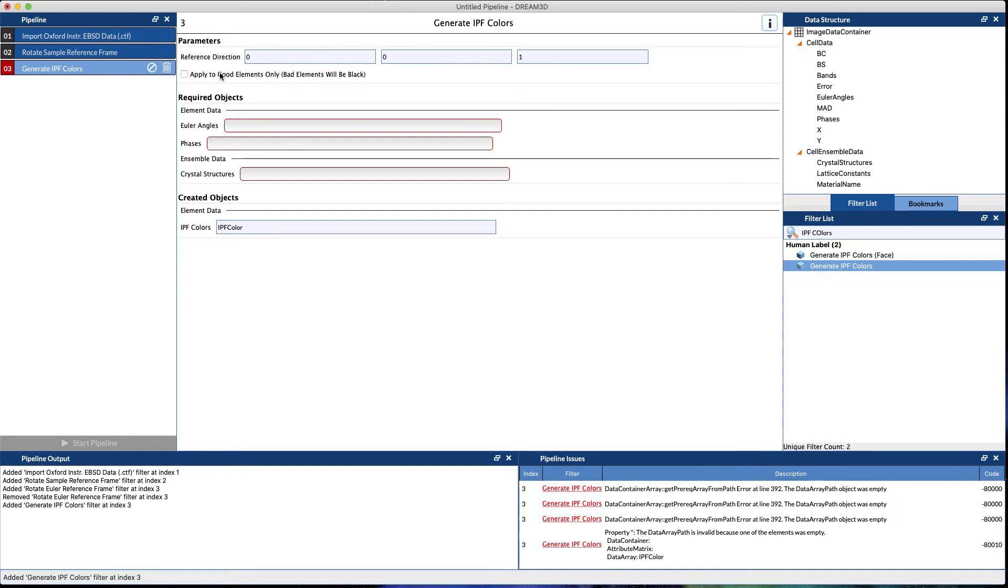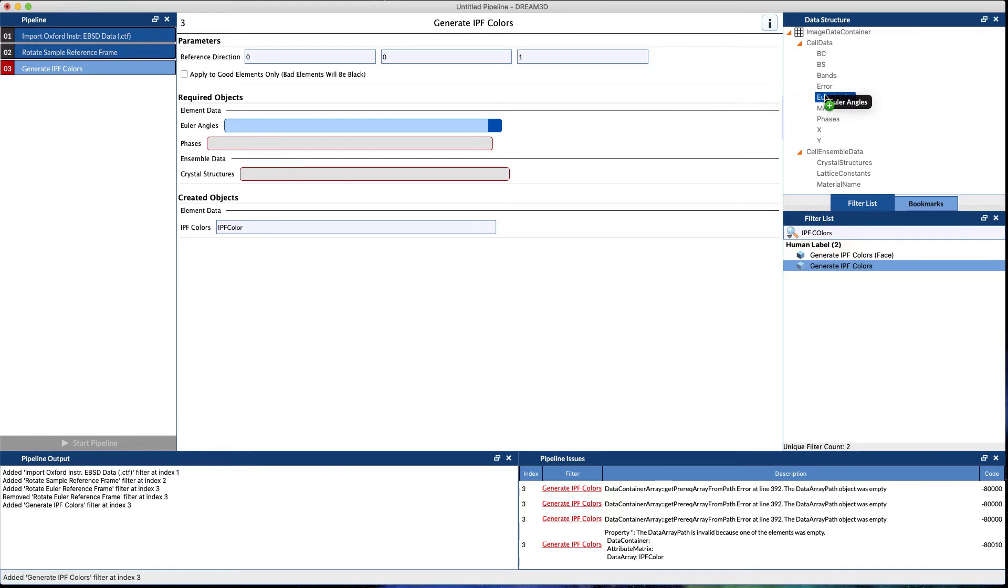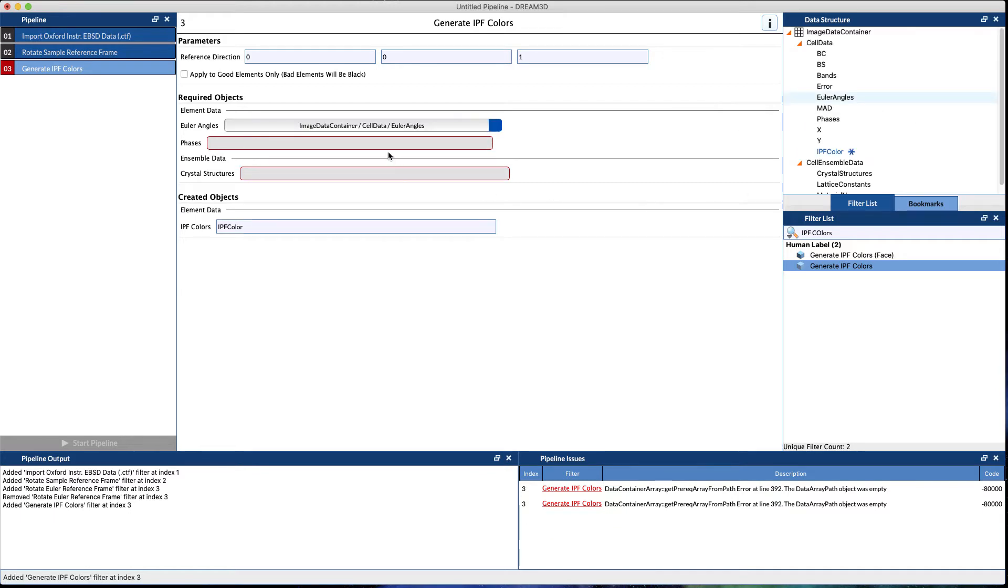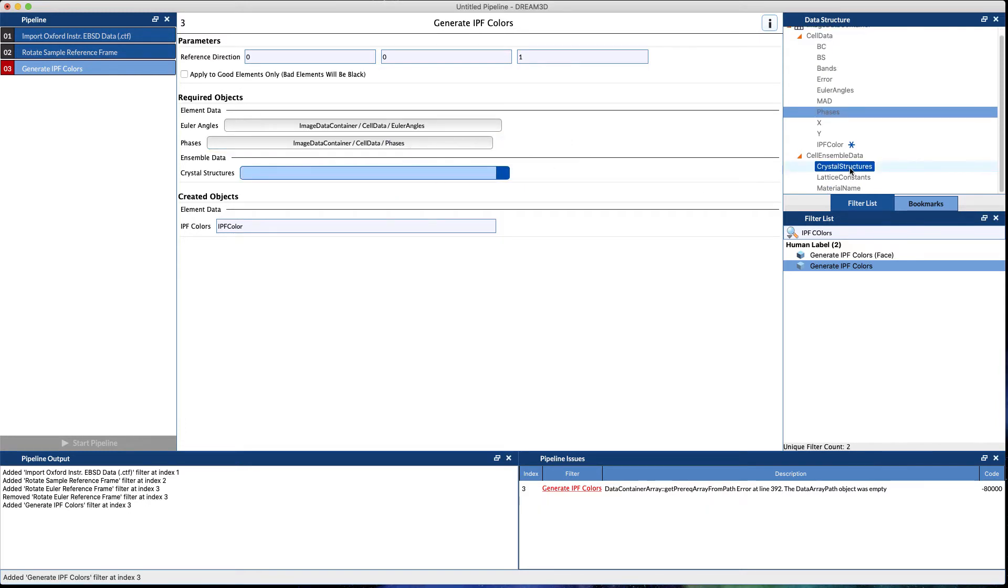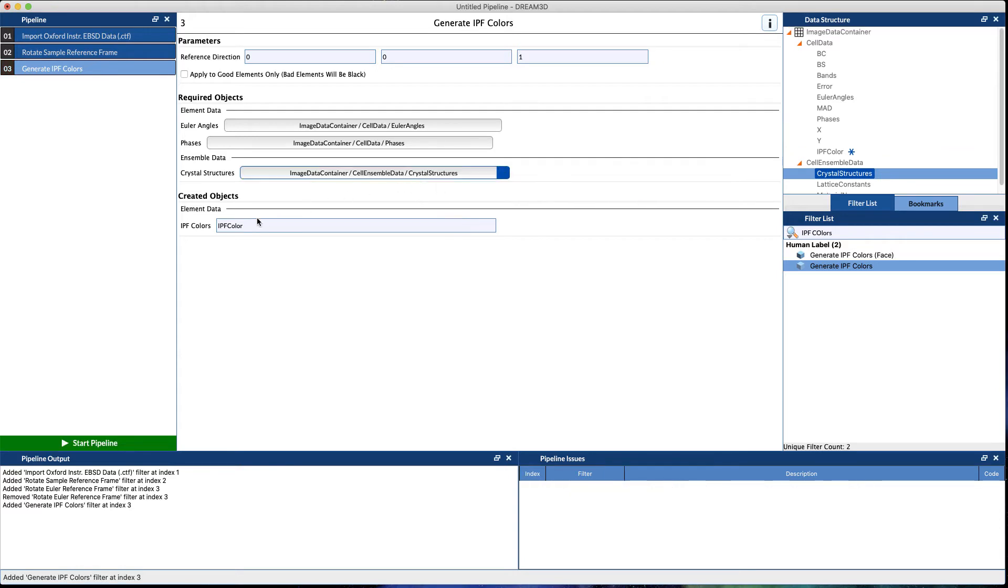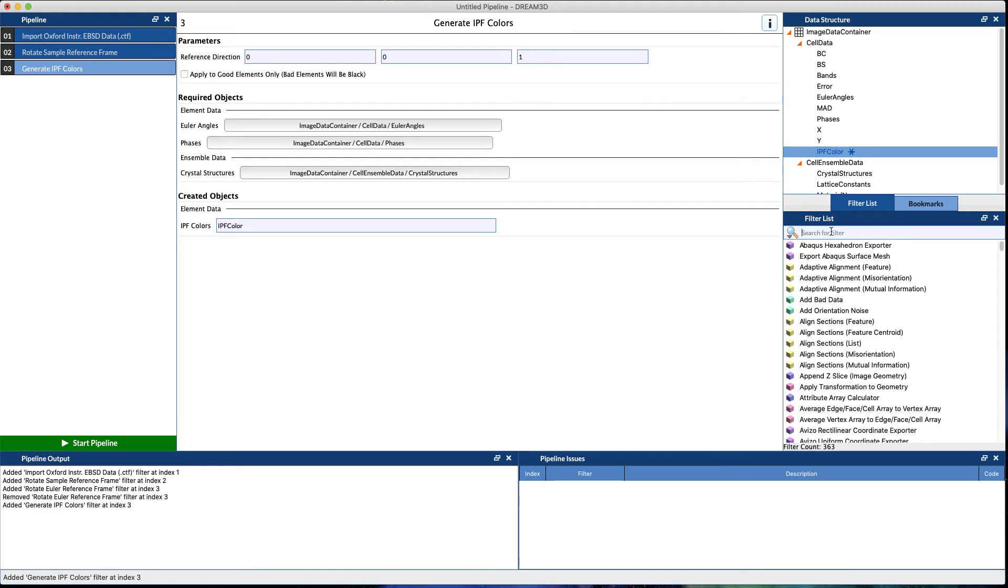We haven't done any thresholding, so we're going to leave this checkbox unchecked for now. We need to select our Euler angles, our phases in case we have a multi-phase material, and also select the crystal structures. We'll name the output array IPF color, and you note it shows up in blue to say hey, that's a new array.